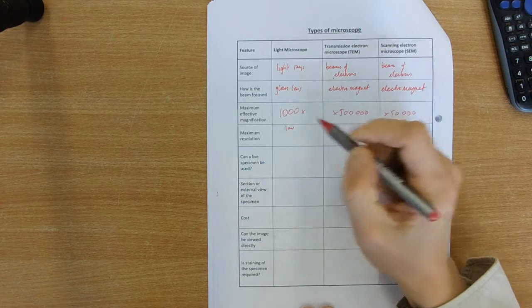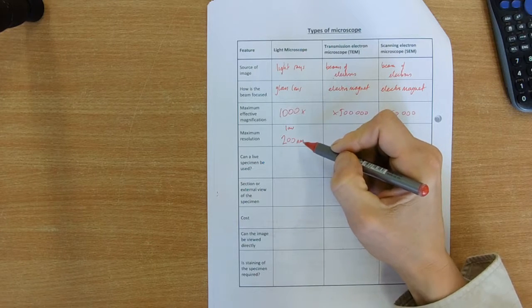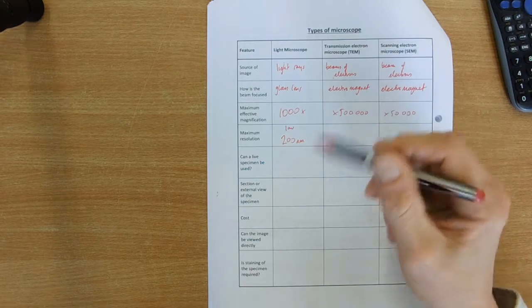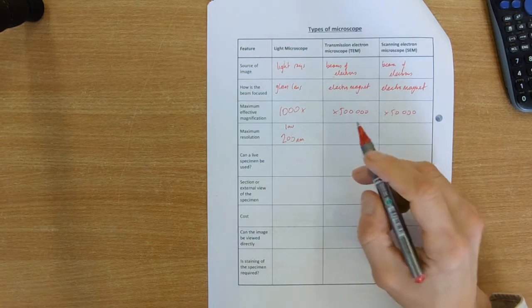Resolution. Low, or lower than the others. So we're looking at 200 nanometers. Remember, a nanometer is 1,000th of a micrometer, which is 1,000th of a millimeter. So it's not bad, but for looking at really detailed stuff, you kind of lose the resolution.